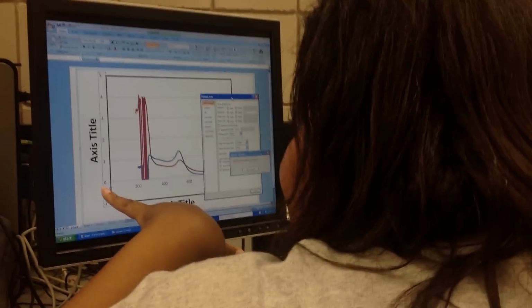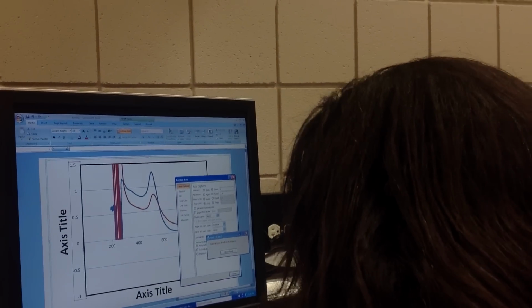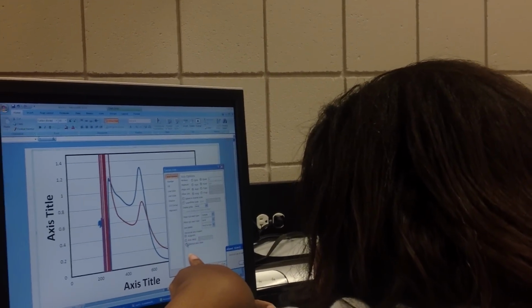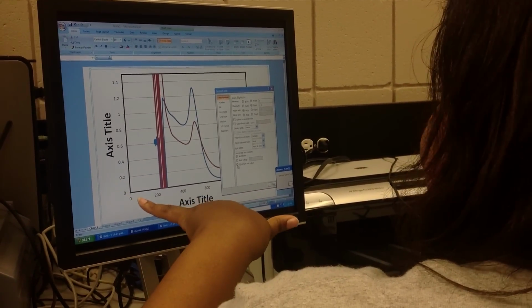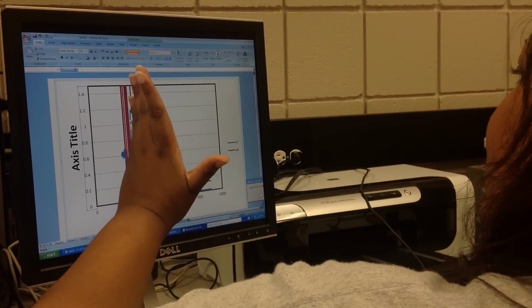Our minimum is going to be 0, in the place where our horizontal axis crosses. If we don't have a 0 and 0, it's going to be at the minimum axis value normally, but it's okay. So this we don't want. All we're interested in is from here to here.